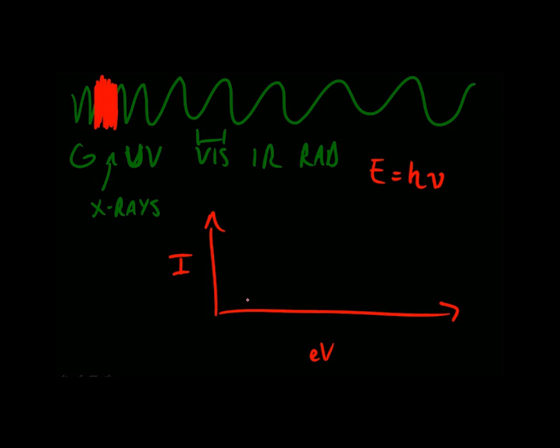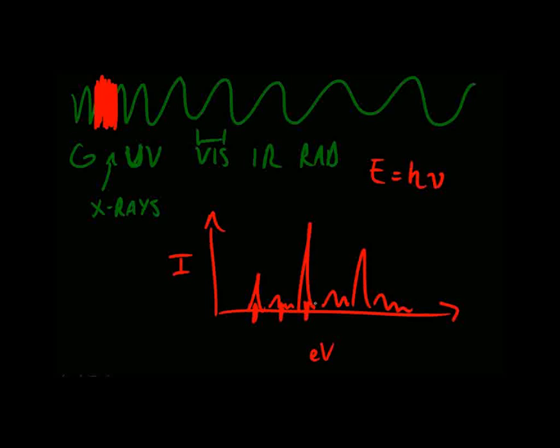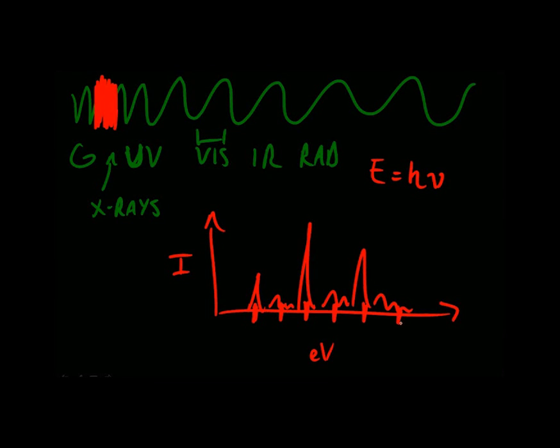So what we'll see is different spikes like this, and different energy spikes turn out to be characteristic of different elements.